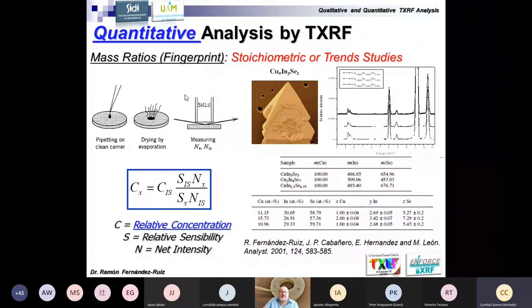And it's so easy as transferring onto the reflector, onto the face of a reflector, a liquid, a particle, okay, the sample, evaluating the intensities, and applying the linear equation to estimate, in this case, mass ratios between the signals found in the spectra.